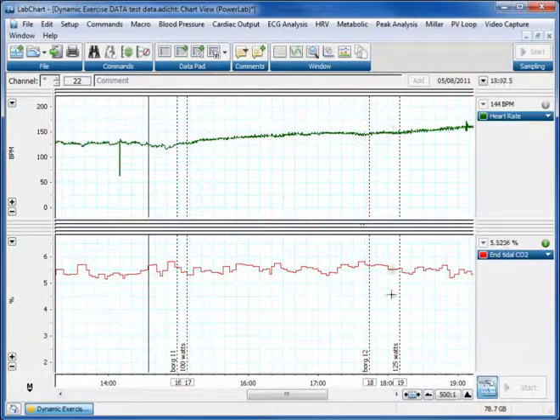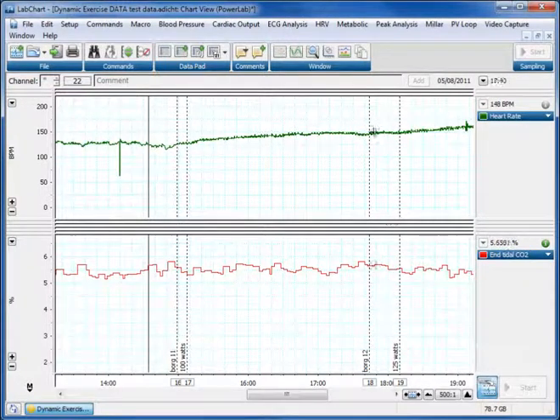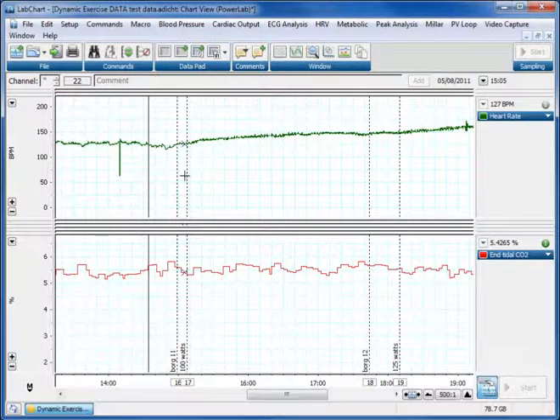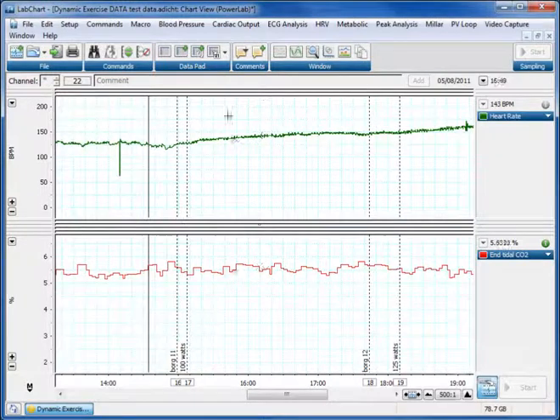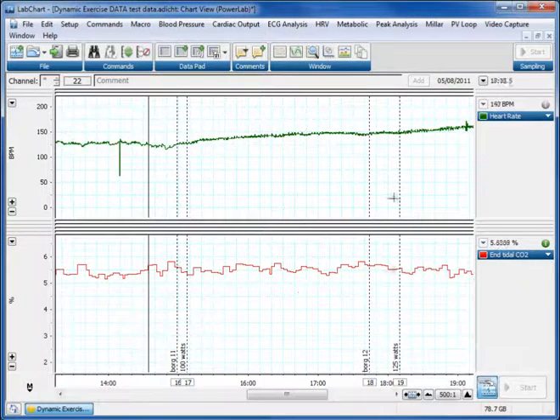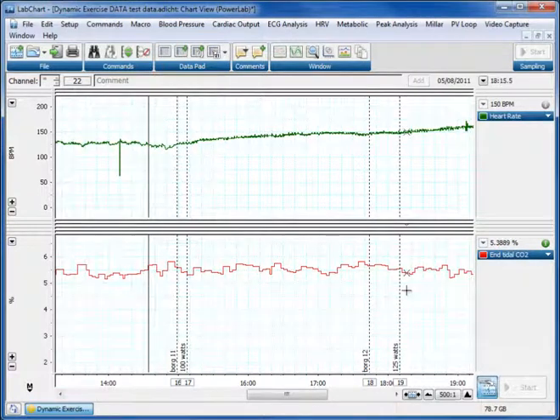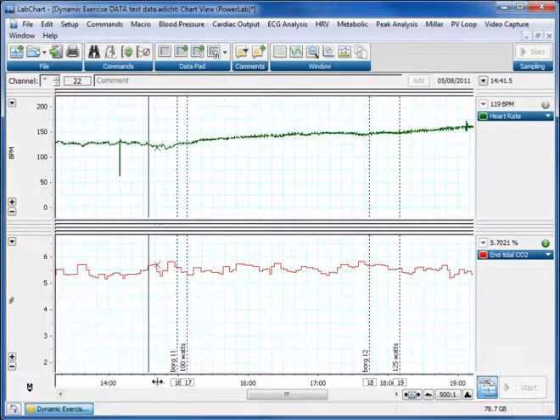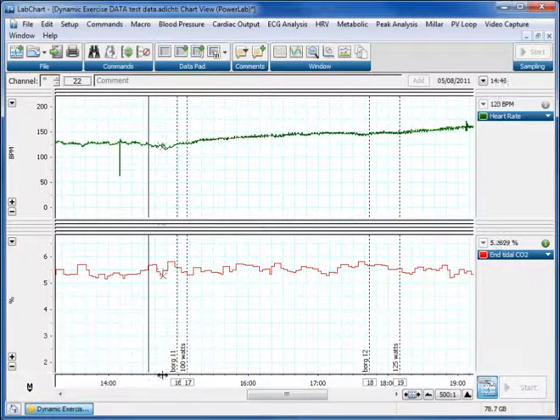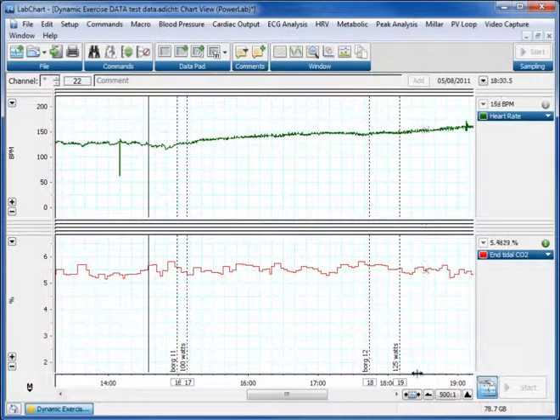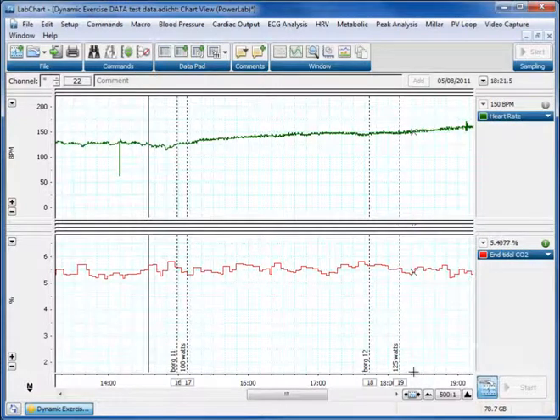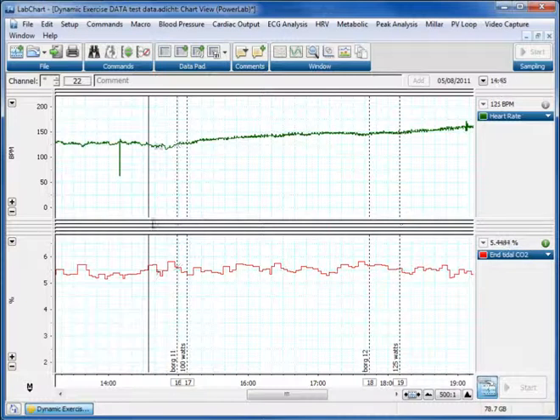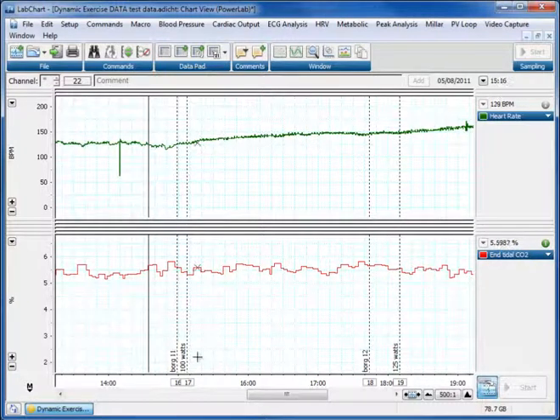So this shows the end tidal CO2 down the bottom, and heart rate at the top. We want to plot a nice graph showing heart rate and end tidal CO2 as a two graph figure. We look at this on the screen, and we decide that the area we want to have in our graph is somewhere just before the onset of 100 watts, and somewhere just after the 125 watts has started, so we can look at the time course of 100 watts exercise and see how things change to show the graph.